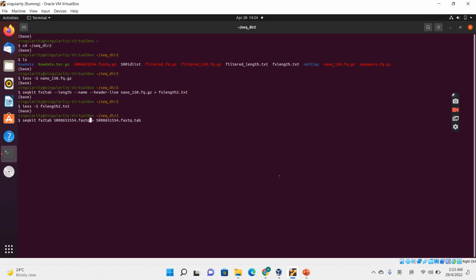Oh, okay, never mind. Still use gz. I haven't decompressed the file.